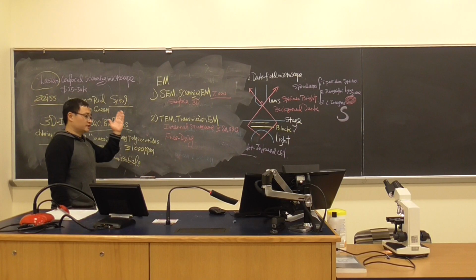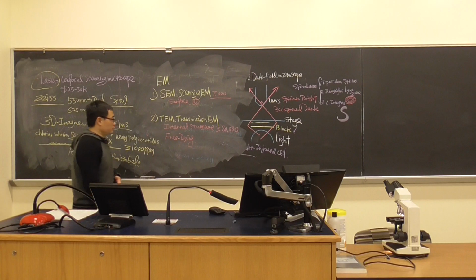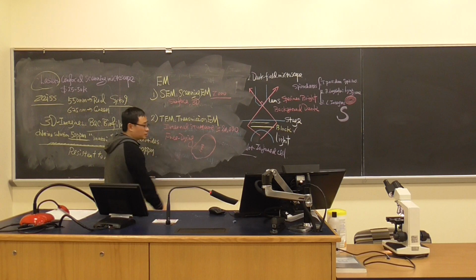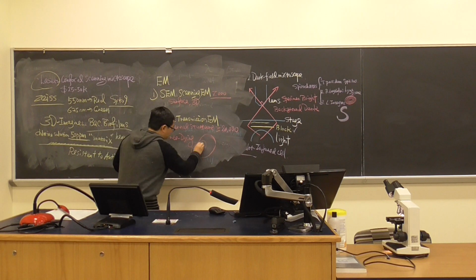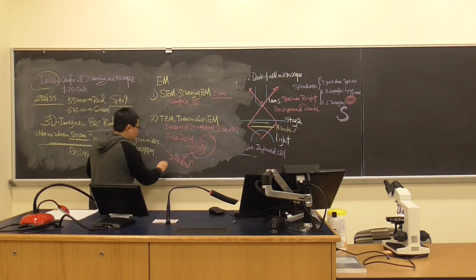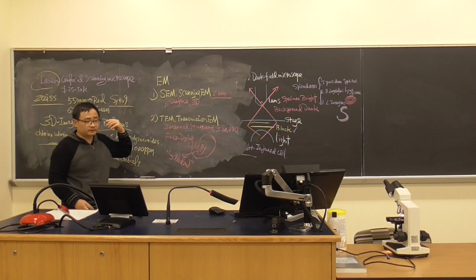And then we have to slice it. The freeze drying is usually using liquid nitrogen. Then we cut into very tiny slices. And when you cut in a very tiny slice, we want to see the internal structure, for example. We call it a shadow. And this shadow, we have to emphasize it, to magnify it.